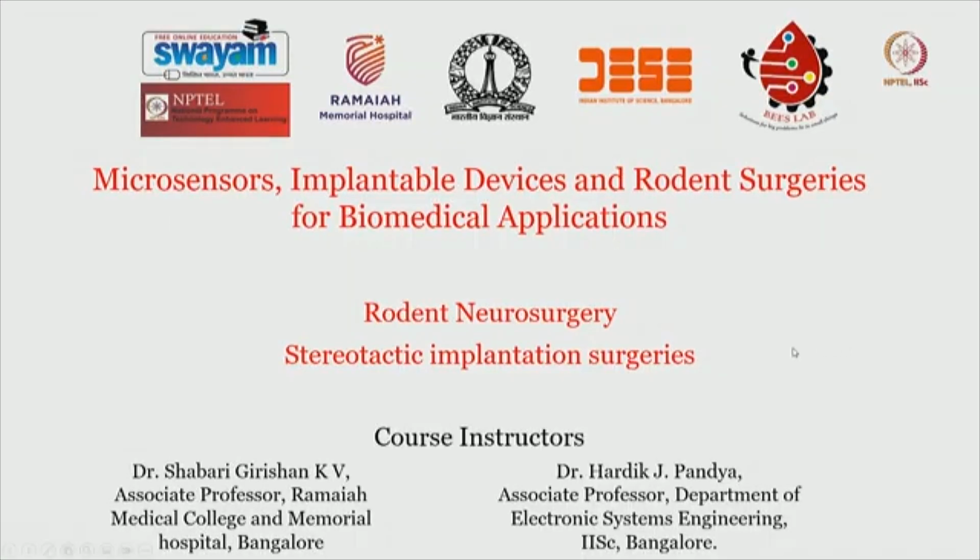So practice your incisions, practice drilling, practice fixing the coordinates, and try and check where you have reached using the cadaveric dissection. Take a brain slice of the cadaveric brain and see whether you hit the target before you actually start performing on the experimental subjects. So with a brief introduction, let us begin today's session on stereotactic implantation surgeries.